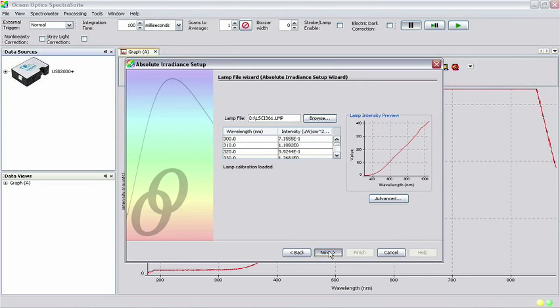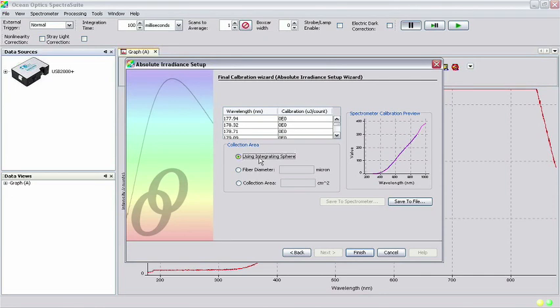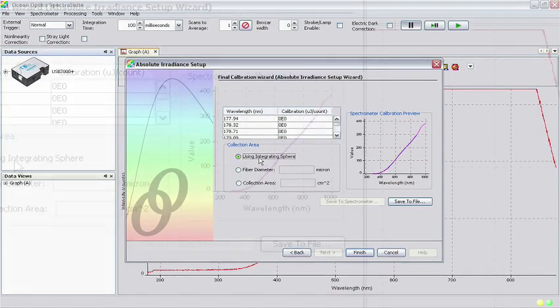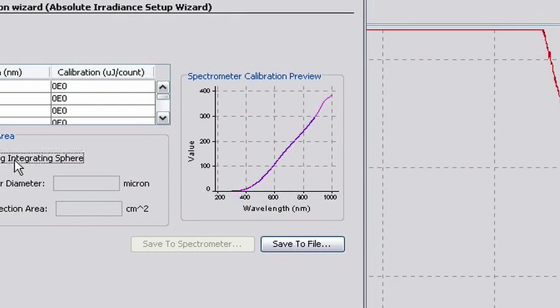In this screen, under Collection Area, the option for Using Integrating Sphere should be automatically checked since you loaded a file for an LSCI Cal-INT. The Spectrometer Calibration Preview Frame should show two lines of different colors nearly on top of one another. This indicates that the calibration file and the measurement of the lamp that generated the calibration file are in agreement.